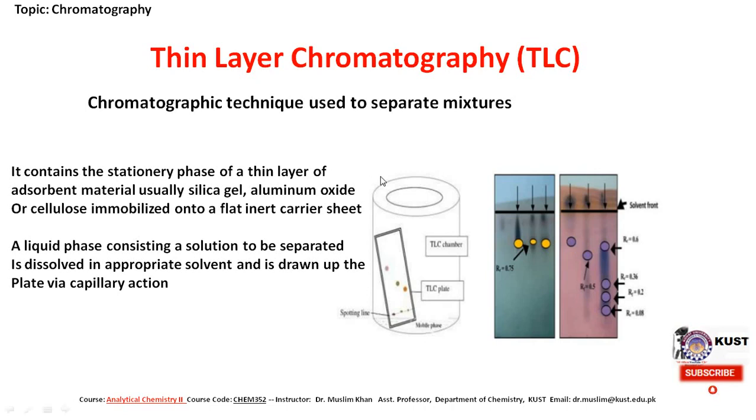Being a semi-quantitative technique, TLC is used more for rapid qualitative measurement than for quantitative purposes. But due to its rapid results, easy handling, and inexpensive procedure, it finds application as one of the most widely used chromatographic techniques. So we have discussed paper chromatography as well as thin layer chromatography.